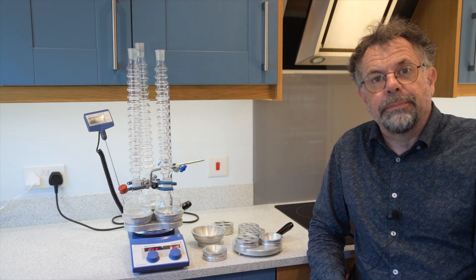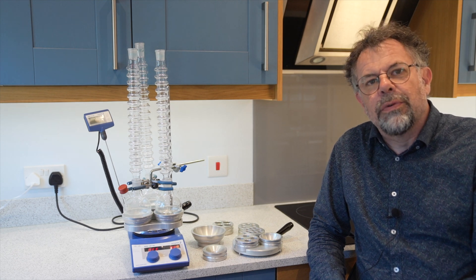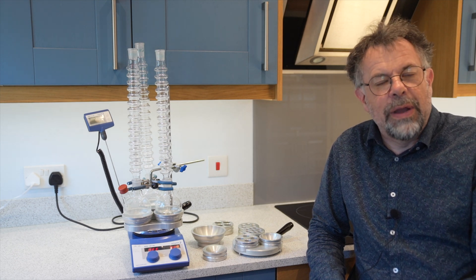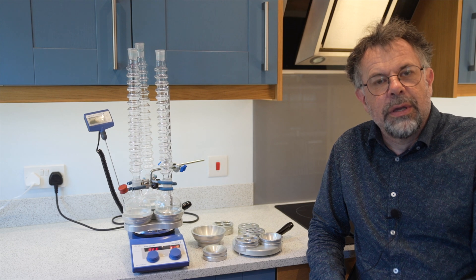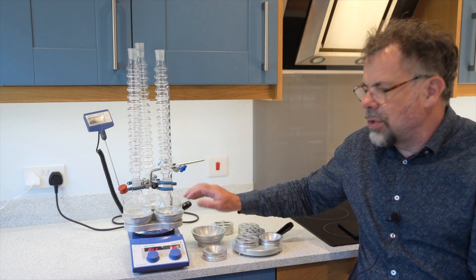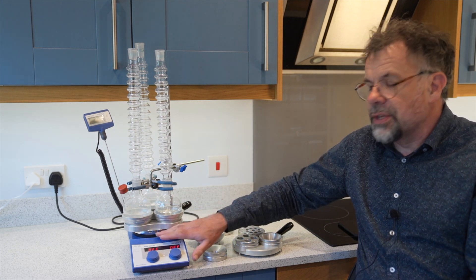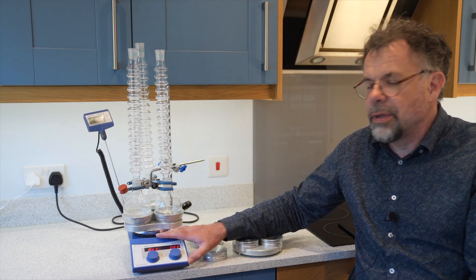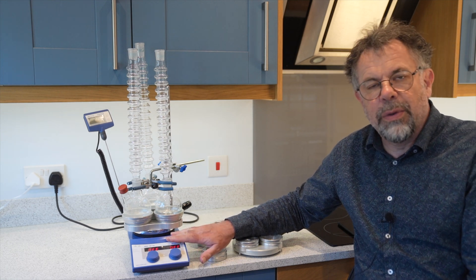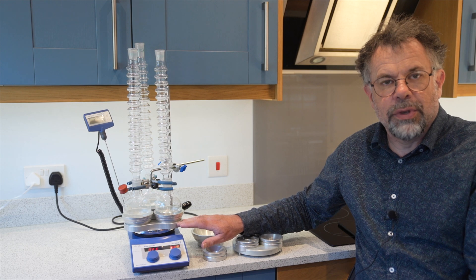What is a Driesing Multi M? Basically it allows the chemist to perform up to three round bottom flask experiments in volumes up to 250 millilitres. We're using a standard magnetic hot plate stirrer, so you don't even have to buy one — you can use what you've already got. It will fit any hot plate stirrer as well.